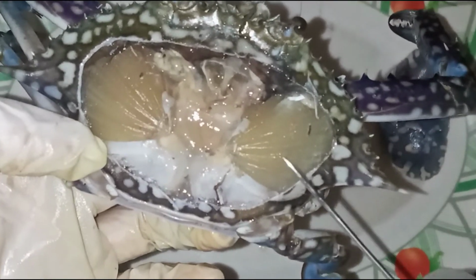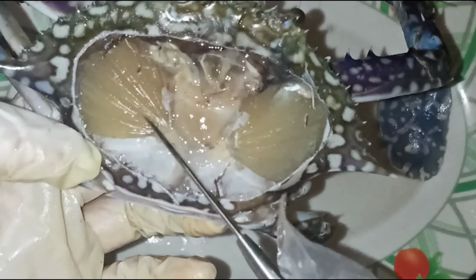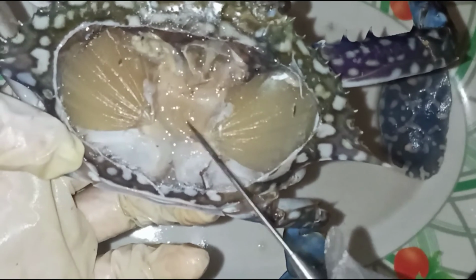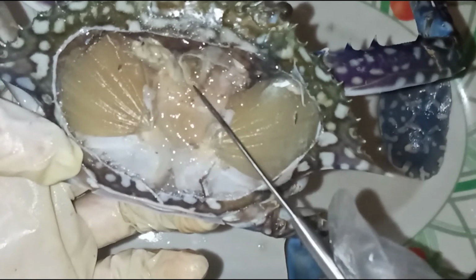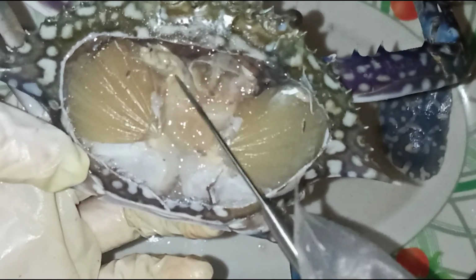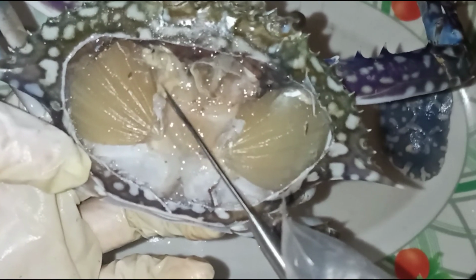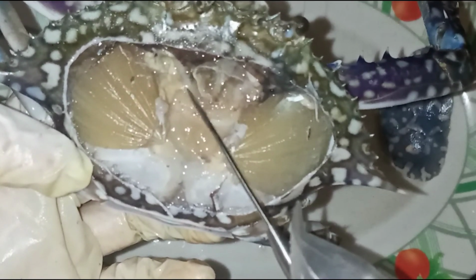For the internal parts of the crab, we have here the gills that are located on both sides. This is the heart, the cardiac stomach, the digestive gland, and also the gonad.